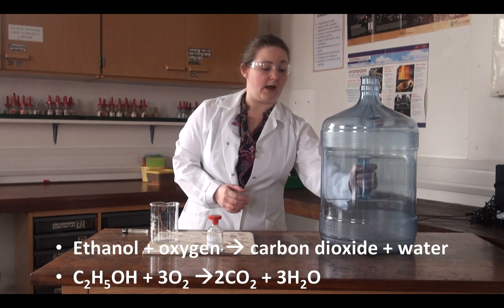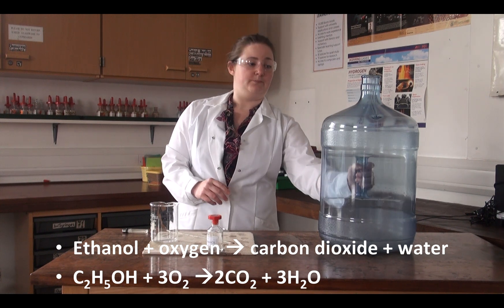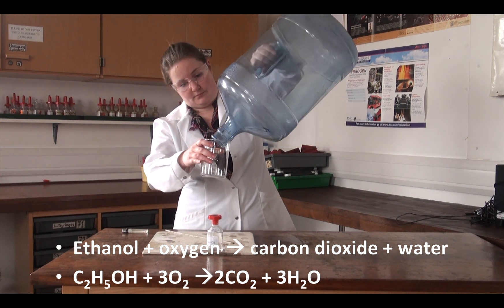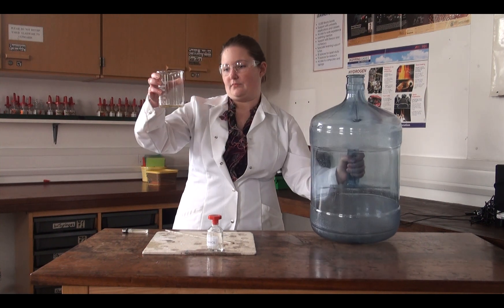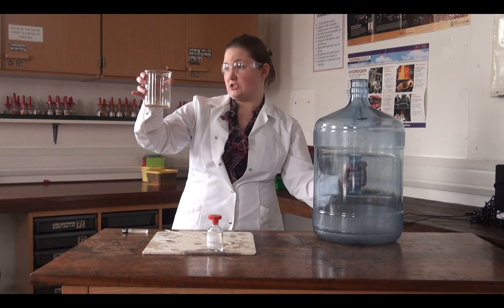You'll remember that bottle's empty — no liquid in it at the start of the practical. If I tip this up now, you can see we've made a liquid, and that liquid is essentially just water.